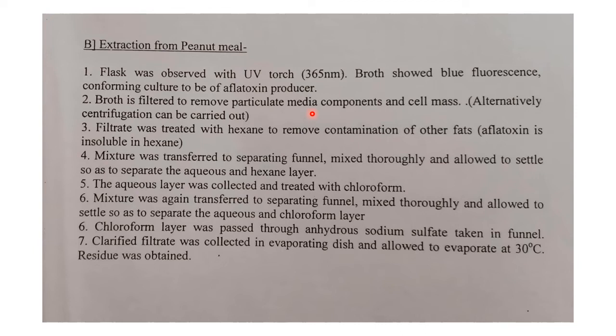Okay, for rice meal we used chloroform, here we are using hexane to remove the contamination of other fats, as aflatoxin is insoluble in hexane, but there we used chloroform where it was soluble. So don't forget, first here you need to add hexane. Then the mixture was transferred to a separating funnel, mixed thoroughly and allowed to settle so as to separate the aqueous and hexane layers. Then the aqueous layer was collected and now you treat it with chloroform.